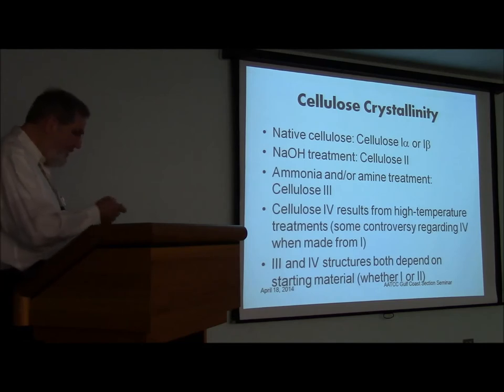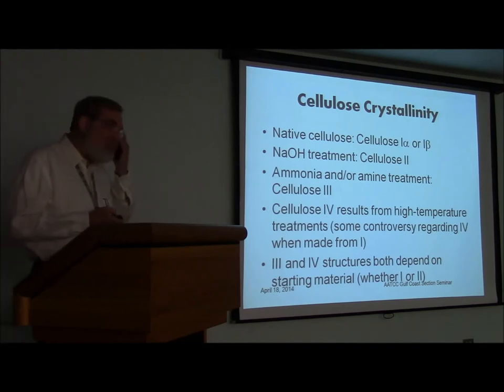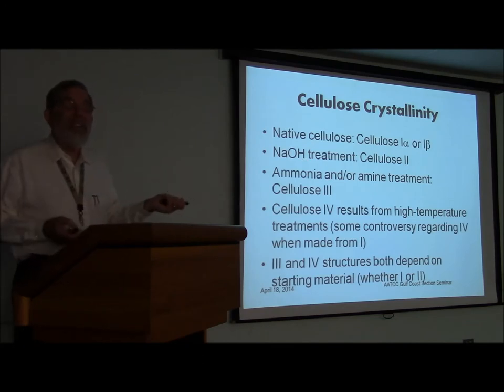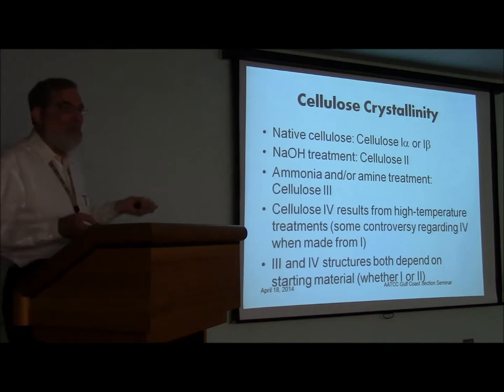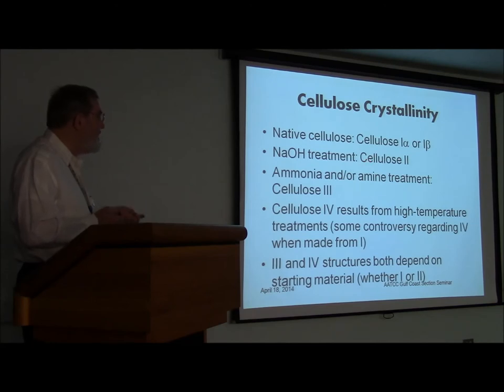So anyway, one of the ideas is to determine which of the crystal forms that you have. So for instance, if you gave it a sodium hydroxide treatment, did I really convert it to cellulose 2 or not? That's an important piece of information in your work, because cellulose 2 has different physical properties than cellulose 1 does.